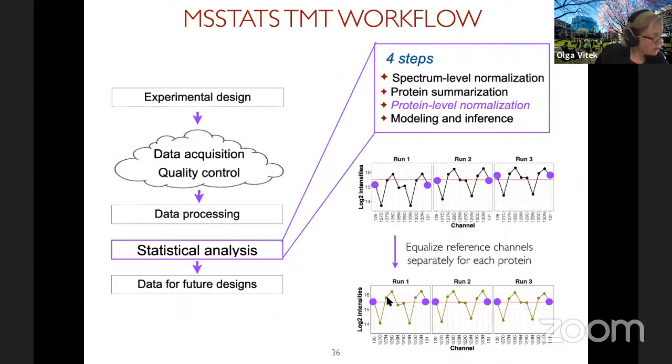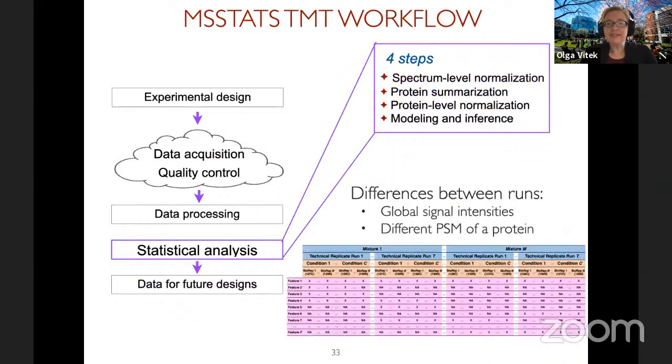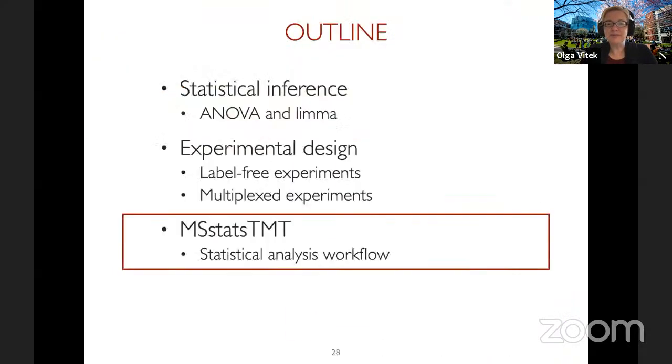What about if I always want to make a comparison within a mix in an equivalent manner to a paired t-test? I guess the question is, what if I want to make a separate comparison here and a separate comparison here? Well, eventually you have to put it together, right? So if your various mixes have the same conditions, just like in regular blocking, let's revisit the regular blocking.